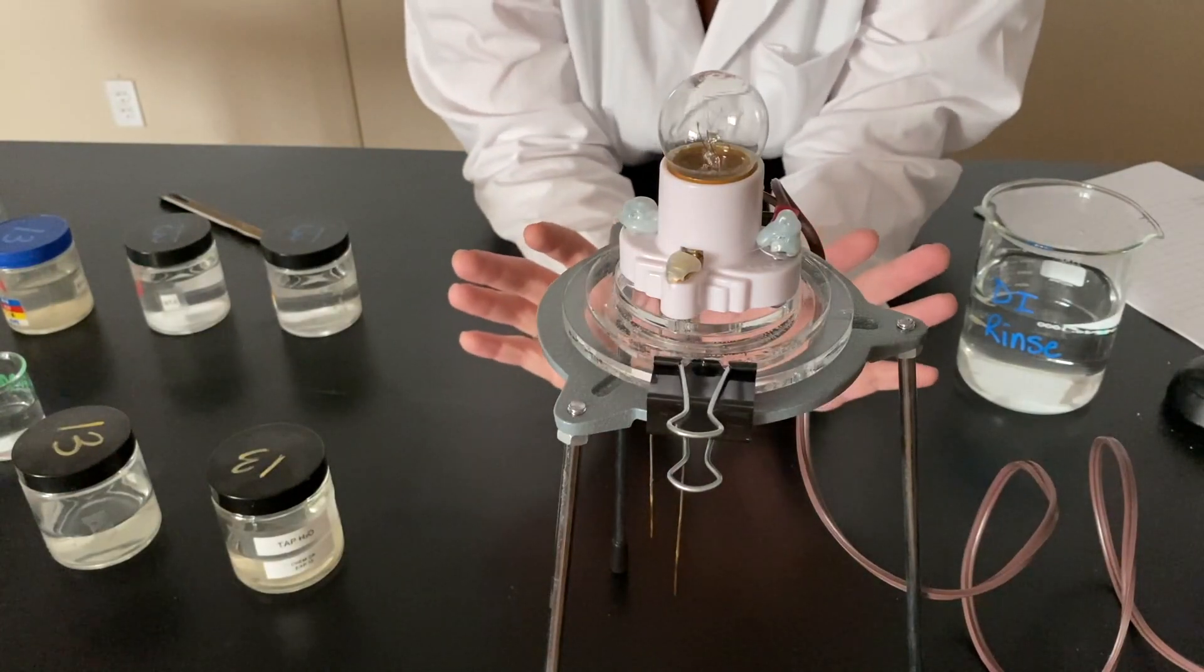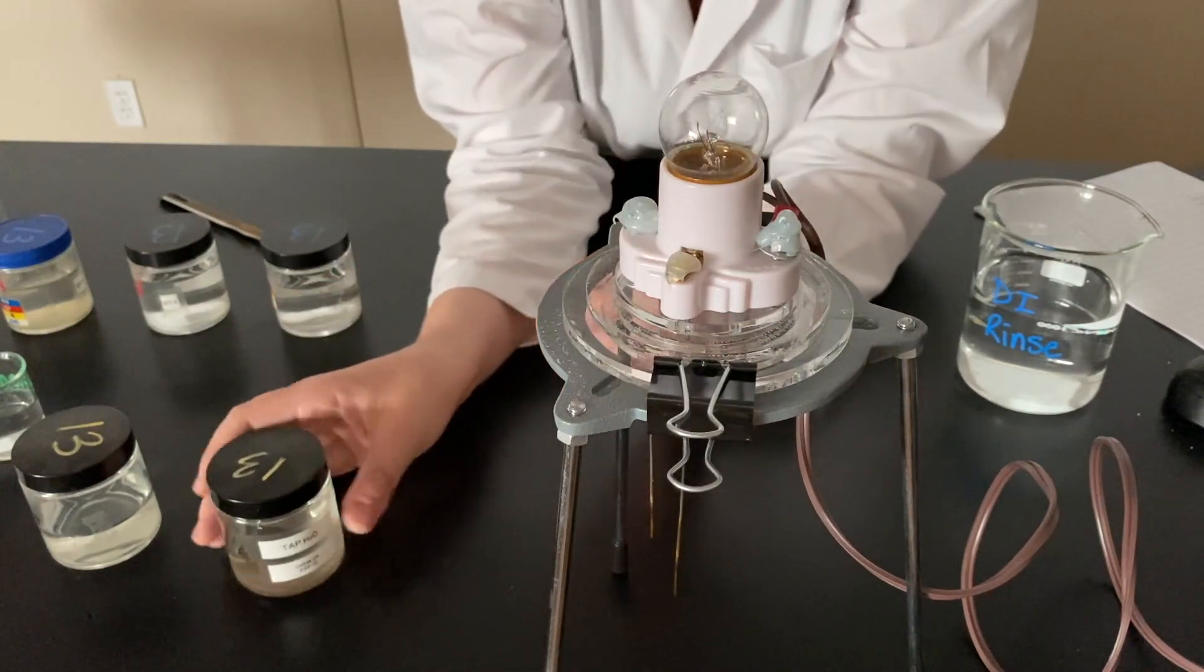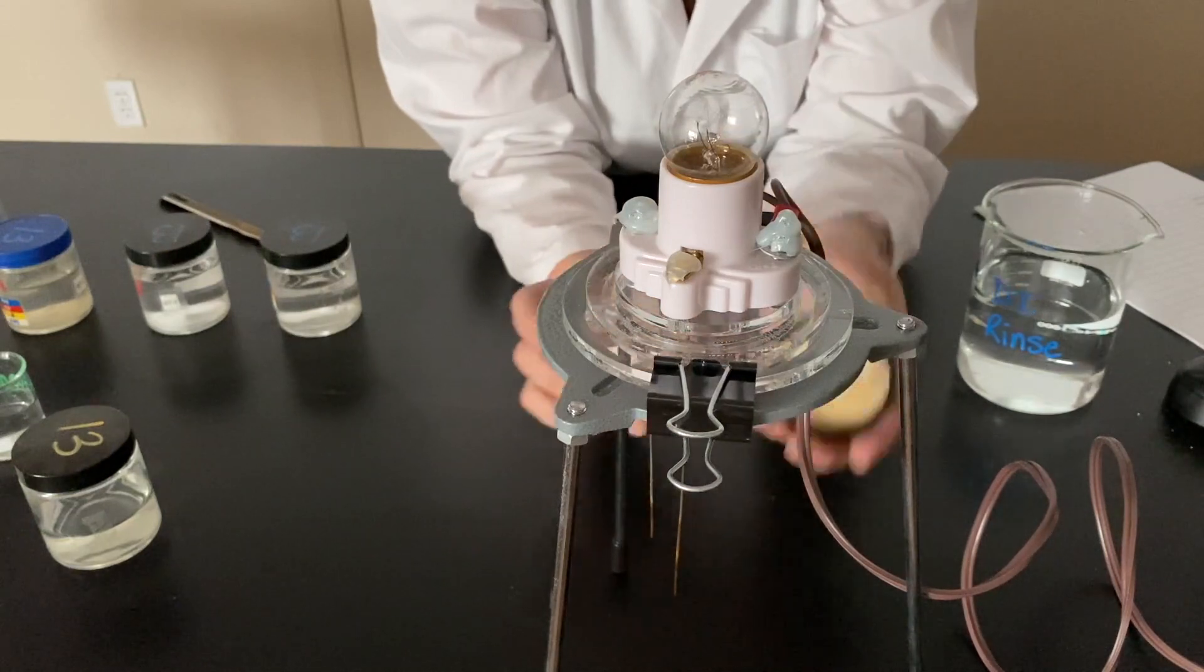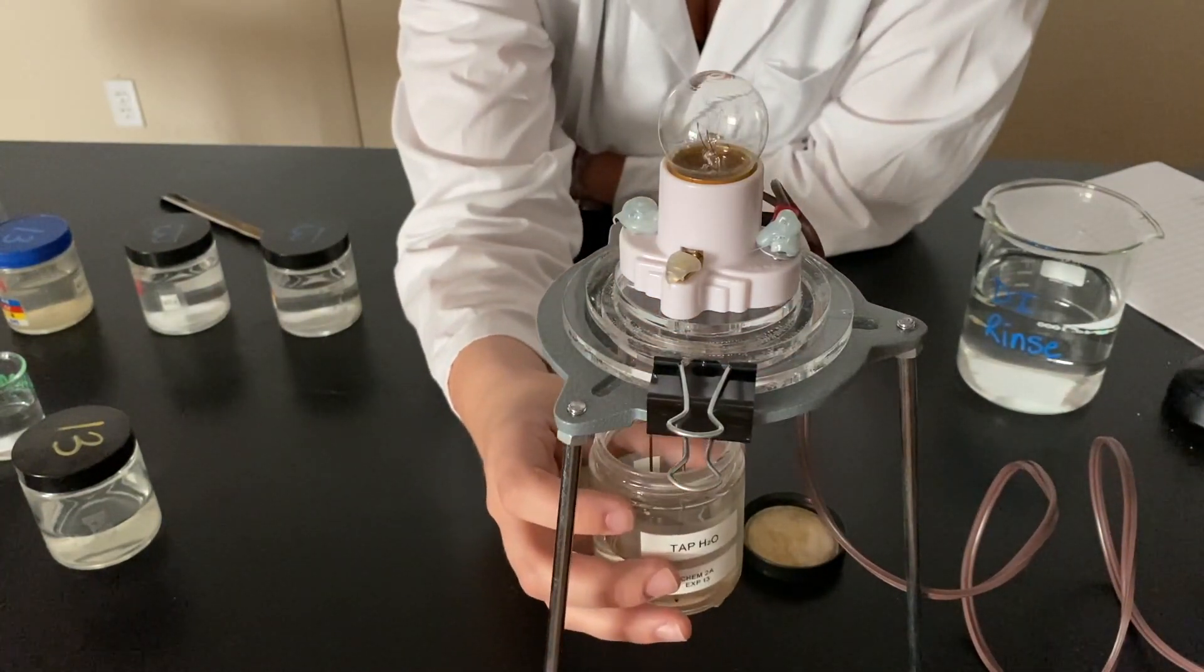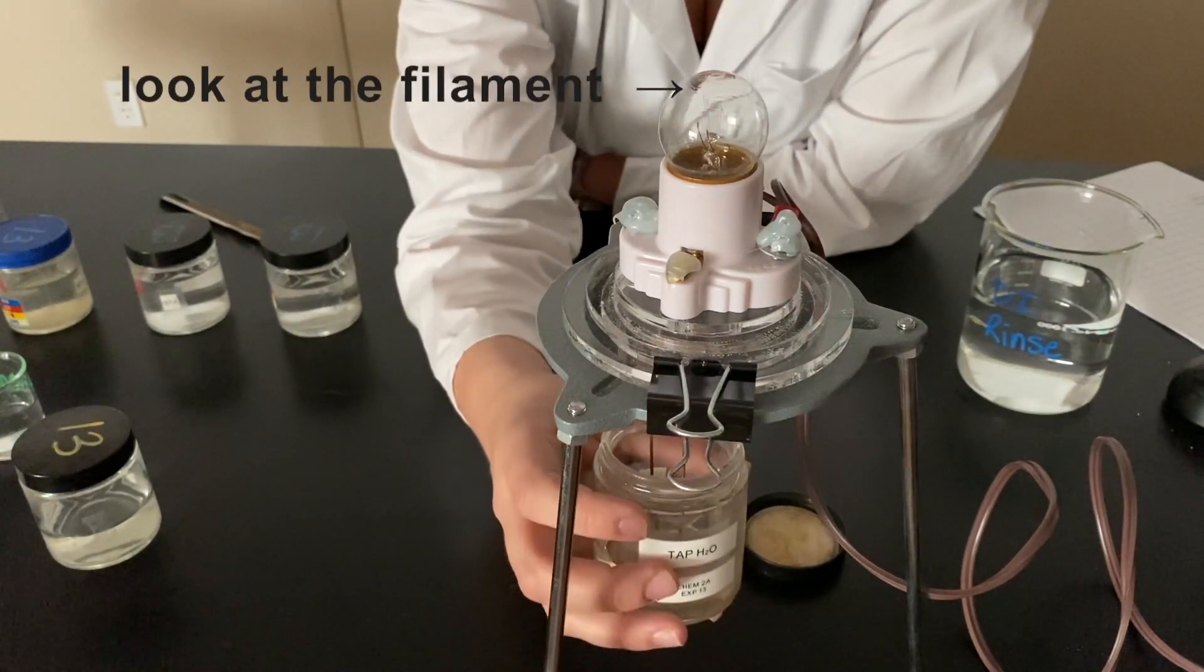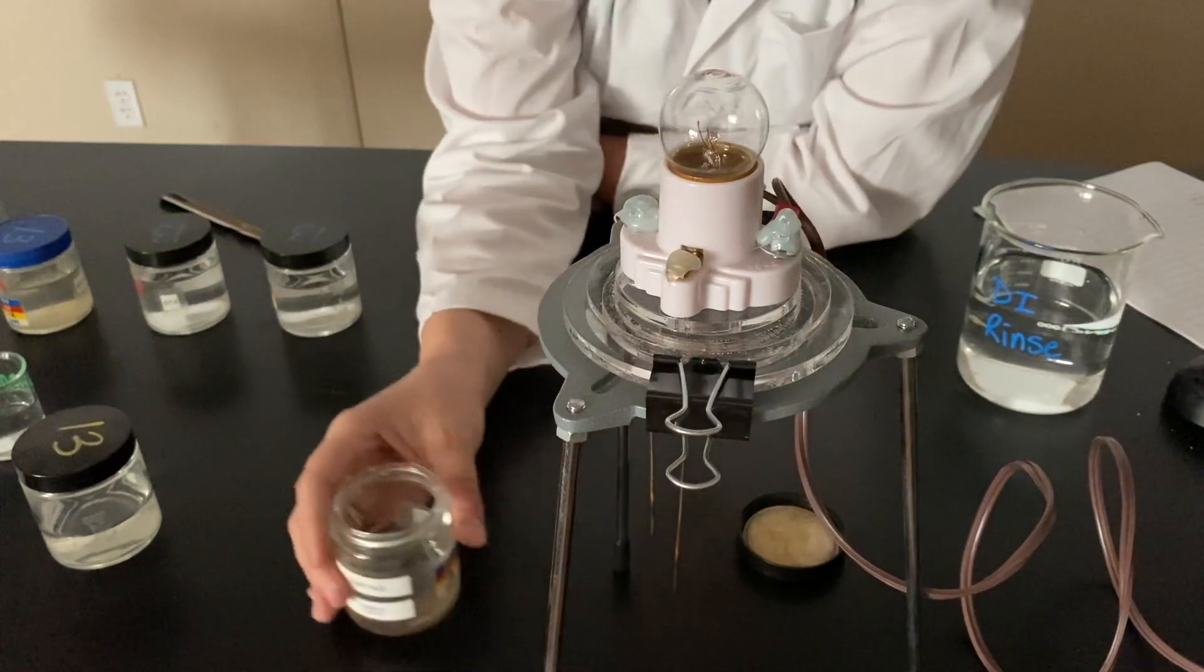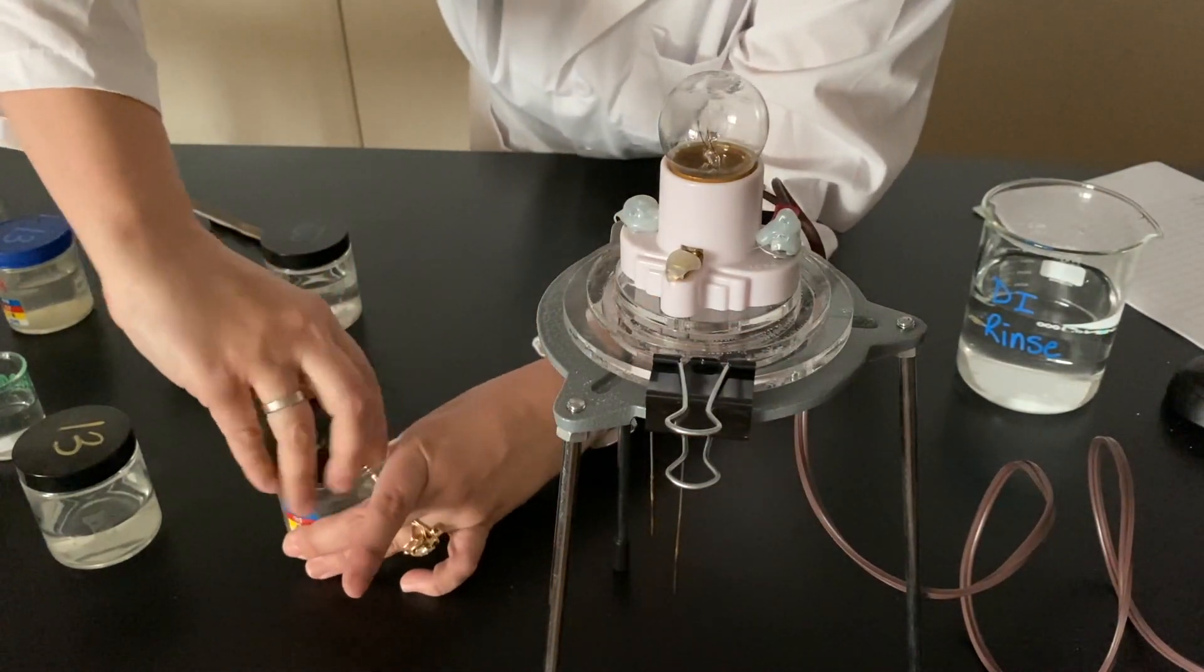All right. So turn the lights off so that we'll hopefully be able to see any weak electrolytes light up. So this is just regular old tap water. You can see it light up just slightly, right? So it would be a weak electrolyte. Maybe I shouldn't give you answers. So there you go. That's tap water.